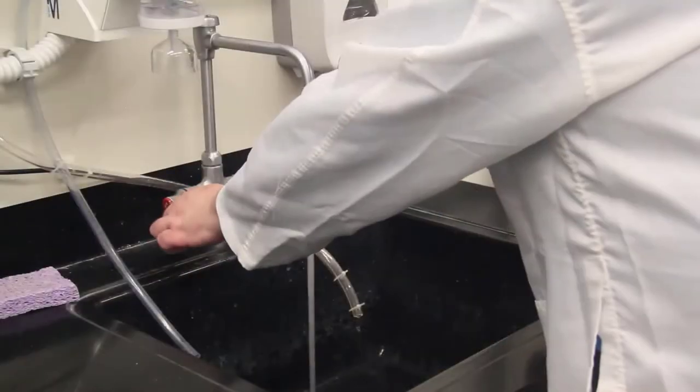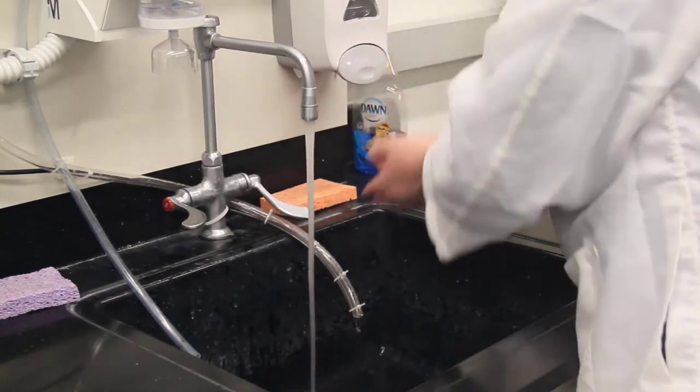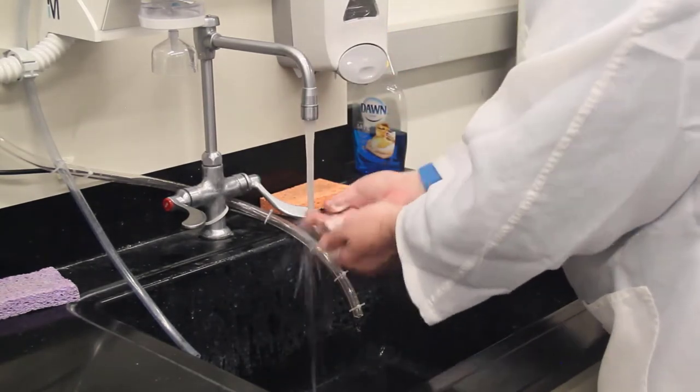Should your skin be exposed to a chemical, the chemical must be washed off as soon as possible. All exposed skin should be flushed with water.